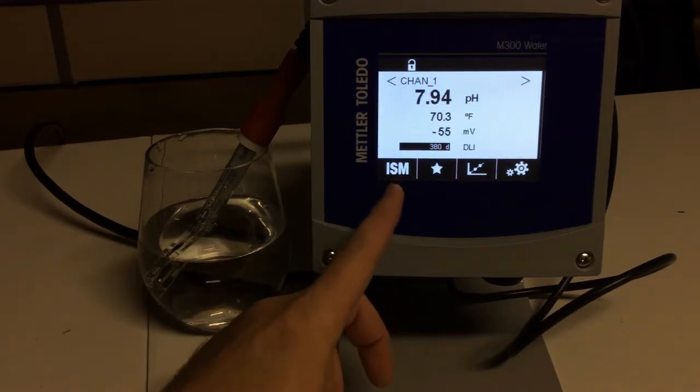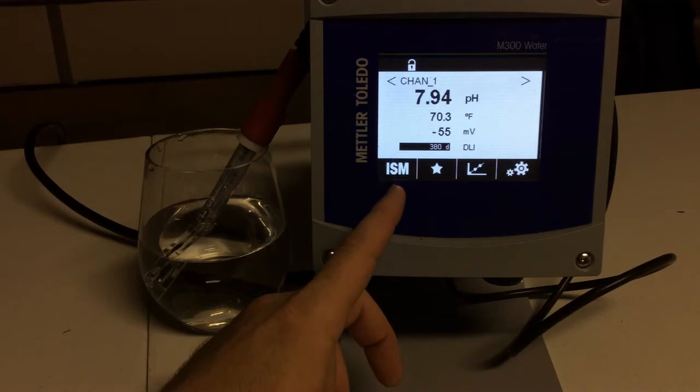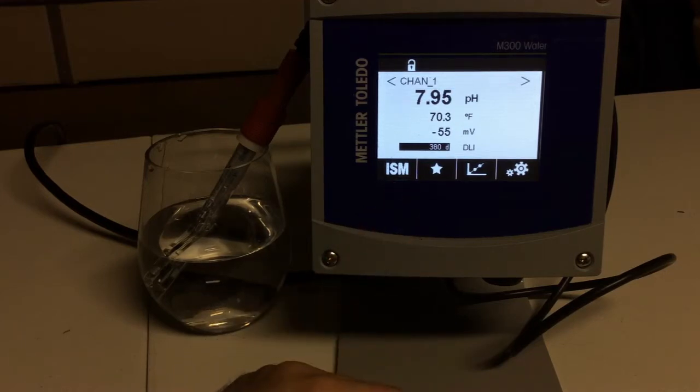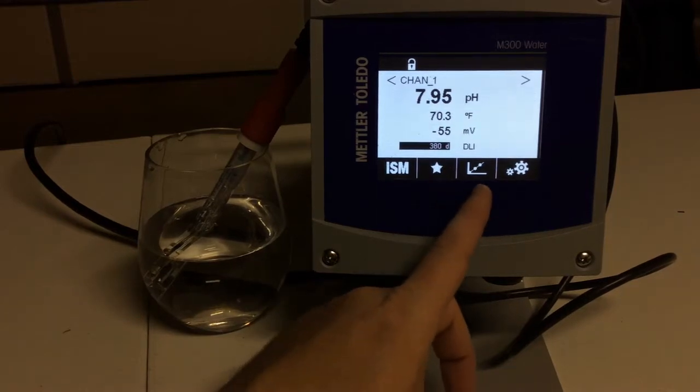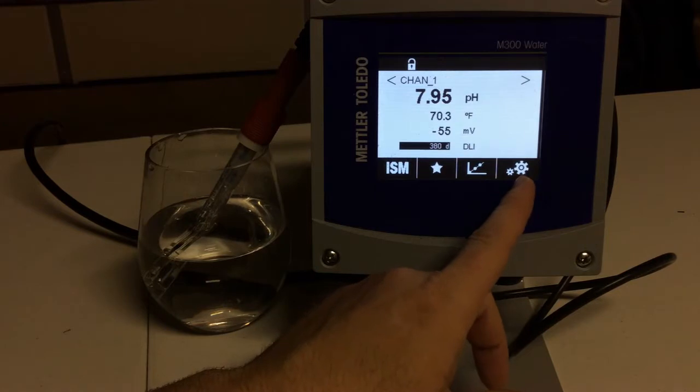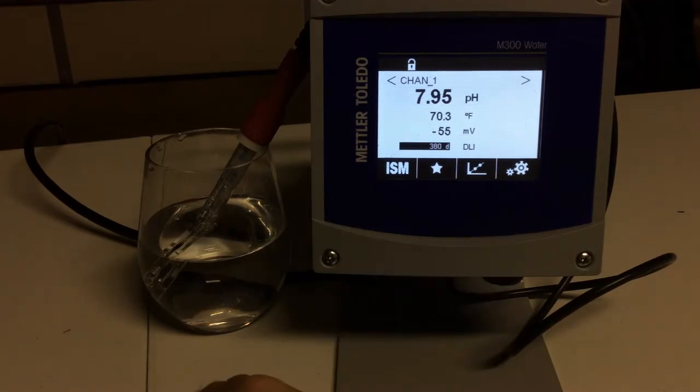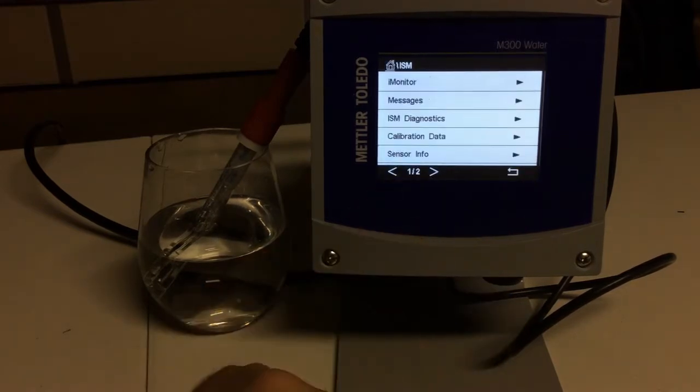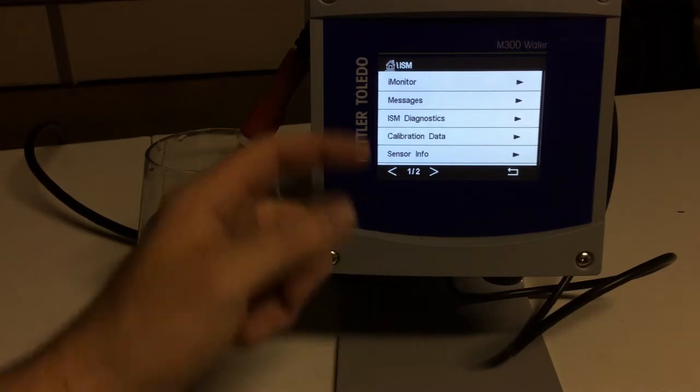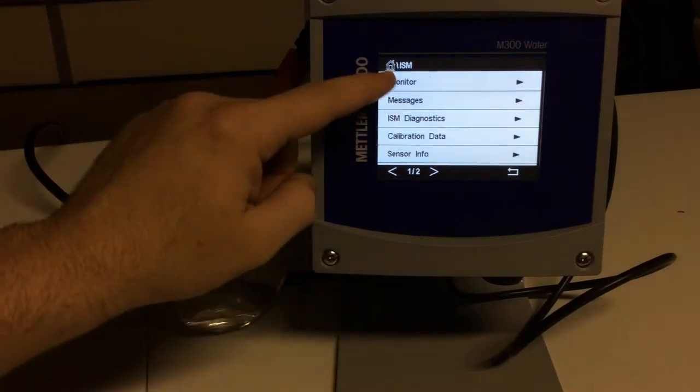The ISM is Intelligent Sensor Management. That is where we can find out information about our sensor, the health of it, how much life it has left, a lot of helpful information for you. Our favorites tab, here's our calibration and maintenance, and then our settings. So, if we come in here to ISM, we can see several functions here.